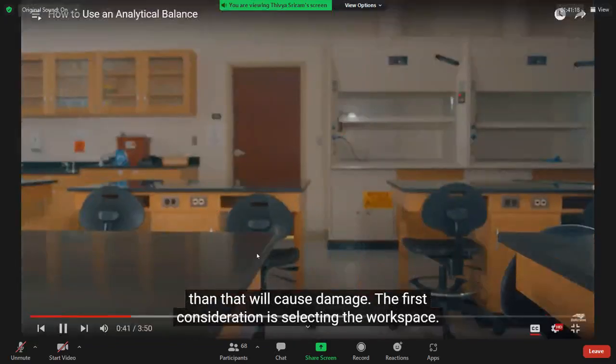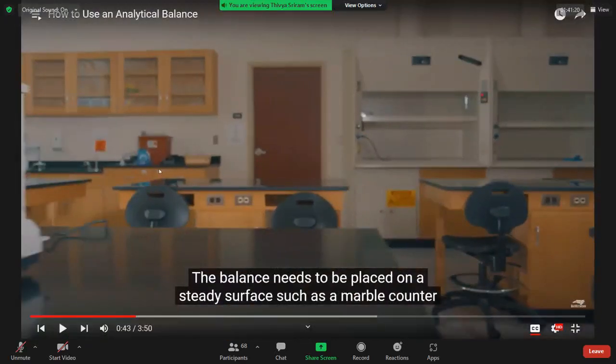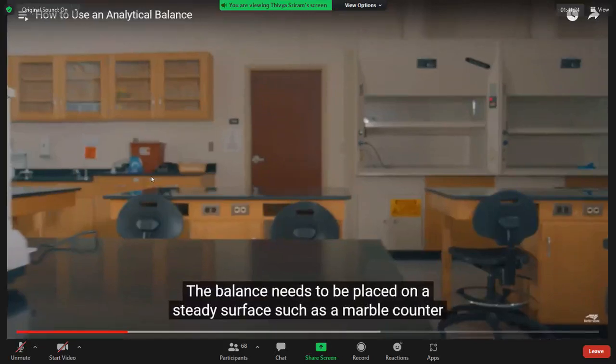The first consideration is selecting the workspace. Here on the balance, you can see that every electronic balance has a minimum as well as a maximum weight range. For example, if the balance has a maximum of 300 grams, then we can't use more than 300 grams. If we use more than that, it will cause damage to the analytical balance.